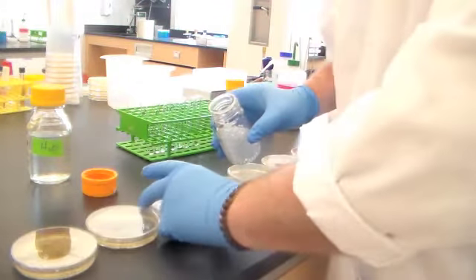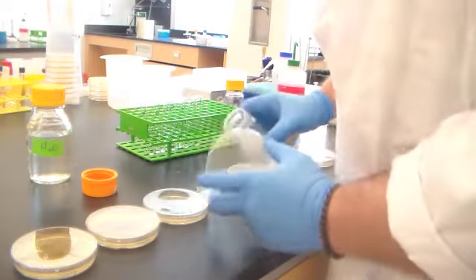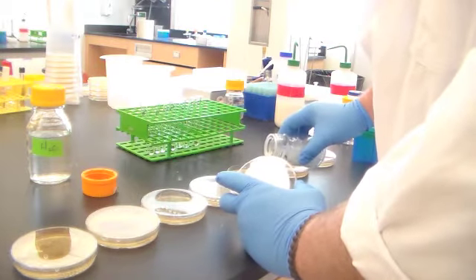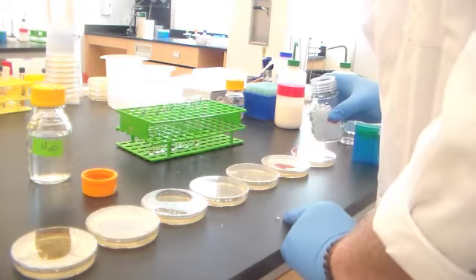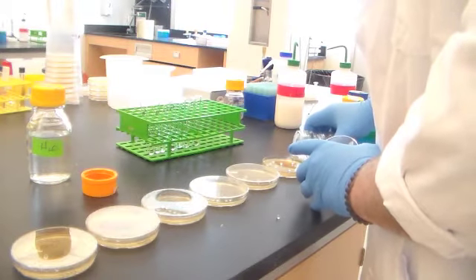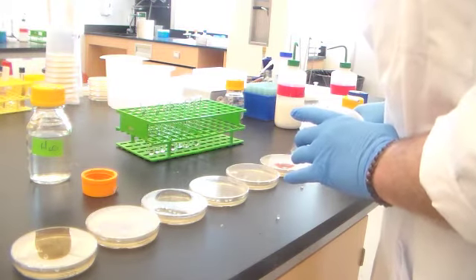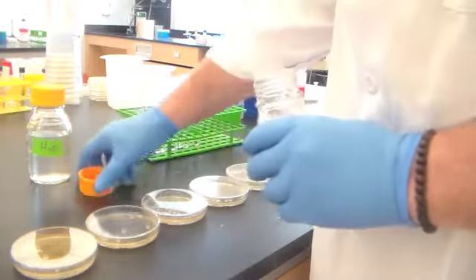Most times, if you've never done this before, you'll bounce some onto the bench top and they'll roll around, and that's fine. Part of the reason why I have you put the, see, right on cue. Part of the reason why I have you put the beads on first before you put the bacteria on is if you had already put bacteria on these plates and some of these little beads bounced off and started rolling around, you could be carrying the bacteria, the E. coli, around on the bench.